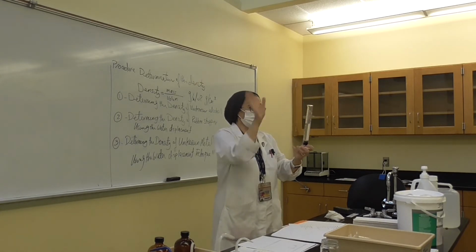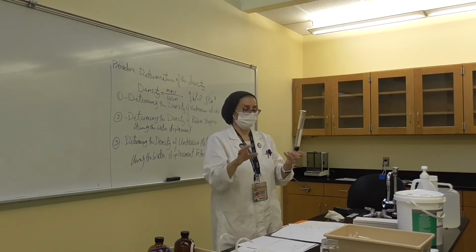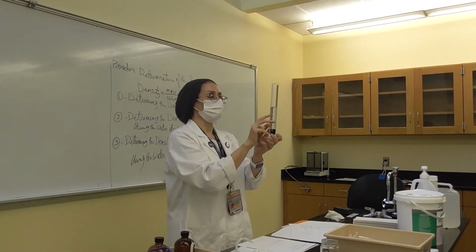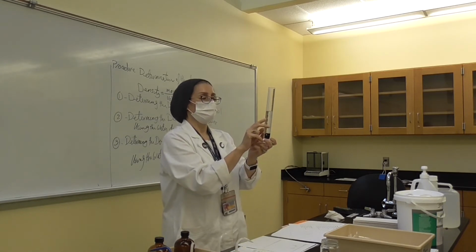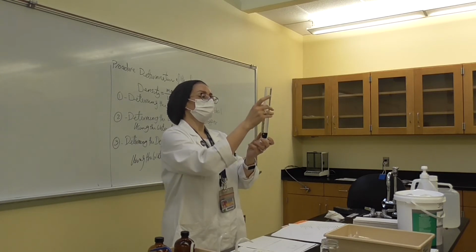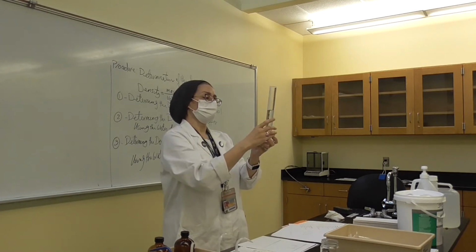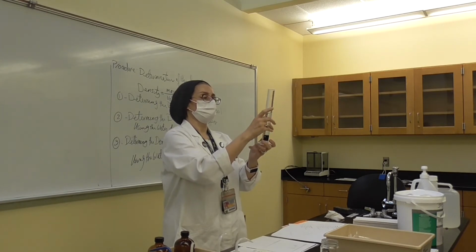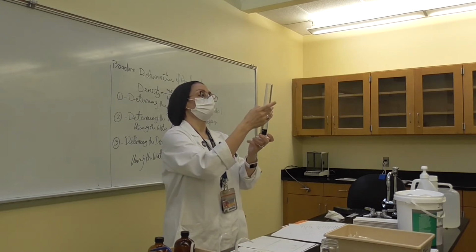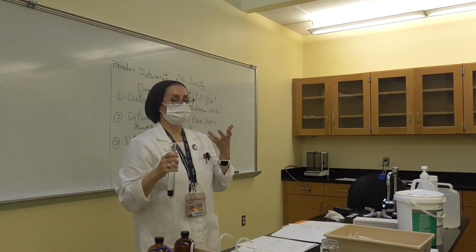Make sure that you're not going to splash the water, because this is a volume and you don't want to lose it. Now you see the level of the water went from, what was it? It was 60, right? Went into, okay, so I have 1, 2, 3, 4, 5, 6, 7. It's like 70, 5, 6, 7, 77, okay?